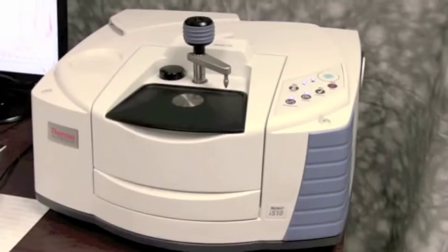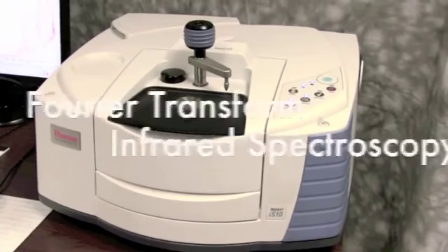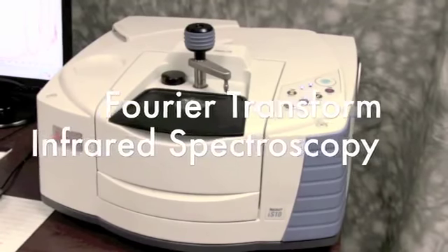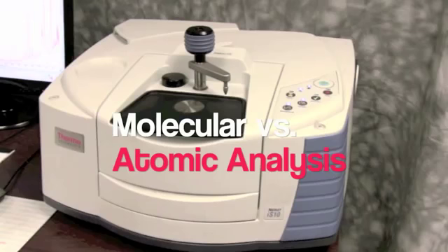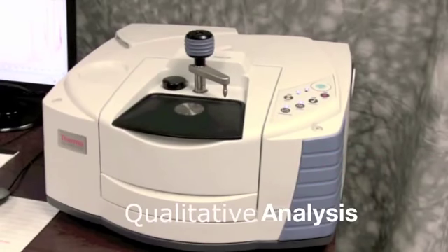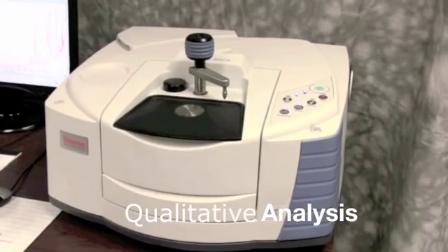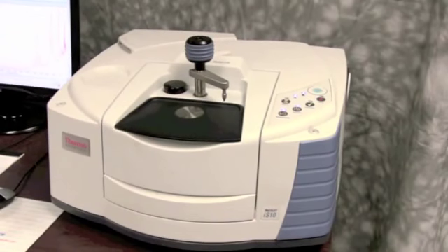We're going to talk about FTIR analysis. FTIR analysis is Fourier transform infrared spectroscopy. It's a molecular versus an atomic analysis, which means that we're going to look at the molecule and not at the individual atoms. It's qualitative versus quantitative. However, you can do quantitative analysis with it, but at laboratory testing, we simply do qualitative.